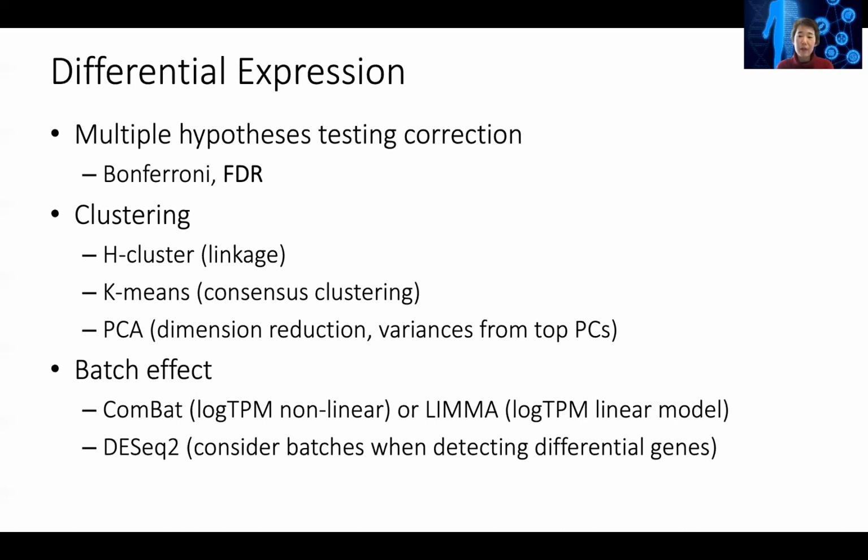We mentioned briefly, intuitively, you can imagine batch as an additional treatment. And you can look at what genes are differentially expressed between this particular batch and remove that out, like eliminate this as a principal component in some sense, and then look at the remaining gene expression. Both Limma and ComBat can allow you to do the batch effect removal. If you have a simpler batch, ComBat is actually really, really good for batch effect removal.